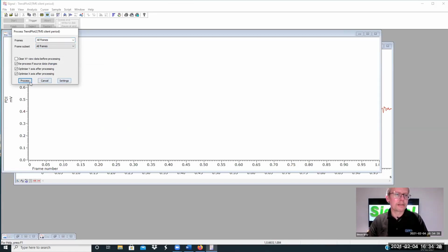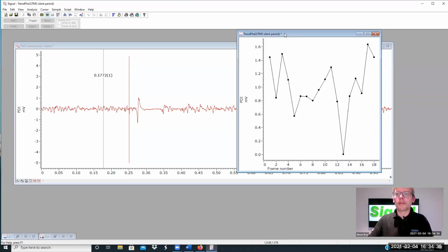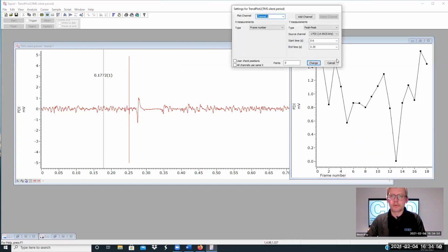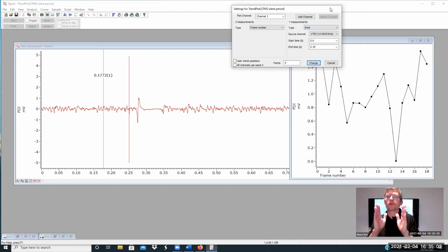We will come back to this and describe it more clearly shortly. There we go. So now that is the peak to peak amplitude within that time range for all sweeps in this file. Okay, so hopefully that gives you an idea, Shiwen. If we go back by right-clicking the XY view channel process, and we said the curve area or area measurement, then we would obtain something similar. But that's using 2 fixed times.